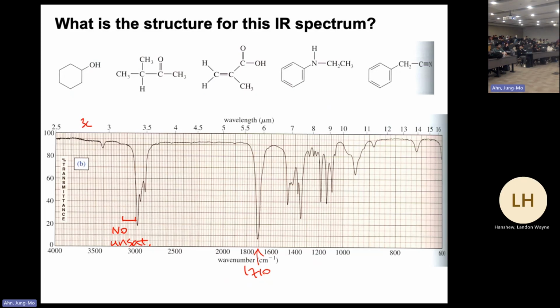And then what is that 3400 signal? That is an overtone of this carbonyl. When you have such a strong, intense signal, sometimes the first harmonic shows up as a visible amount. So that is this. If you have that together with the carbonyl, you have to suspect that it might not be the real one. It may be just the first overtone of that carbonyl structure.